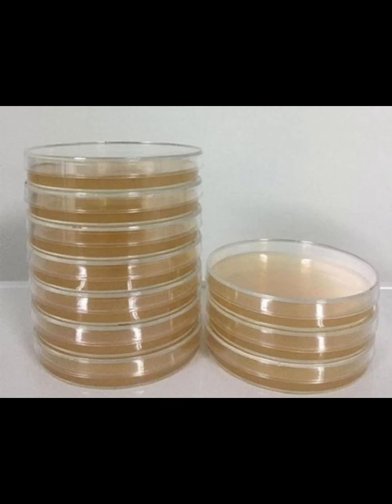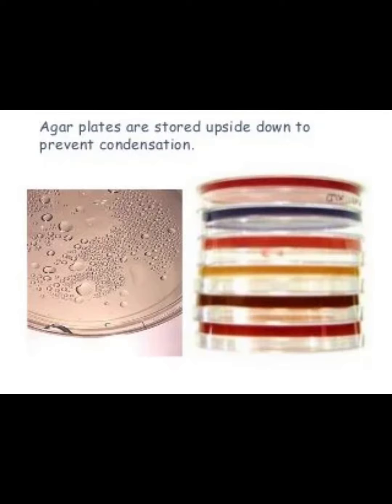Once you have your plates made, put the cover back on and let them sit overnight so that the condensation in the agar can evaporate. Once most of the condensation has evaporated, flip them upside down and store them in the fridge so that the condensation doesn't drip back down onto the agar.